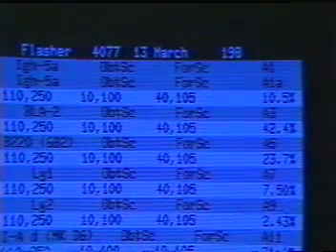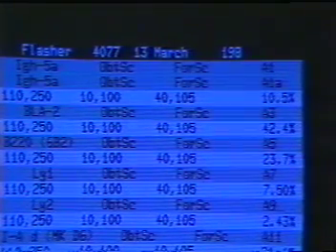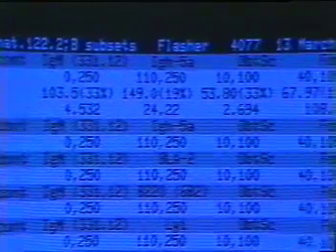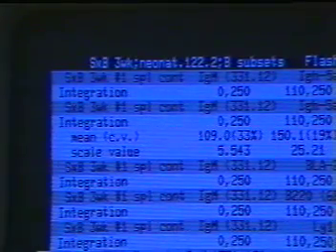The mean fluorescence and scatter values for the cells within the gates can be viewed at the lowest level of the analysis drawer. By positioning the cursor at sample A1 and giving the down-level command, we bring the mean and scale values for the integrated cells into view. By using the flat commands, the cursor may be moved so as to view the statistics on any other sample in the drawer.